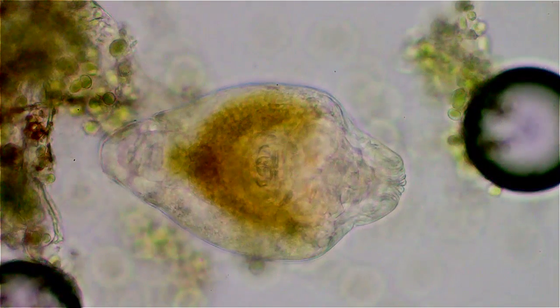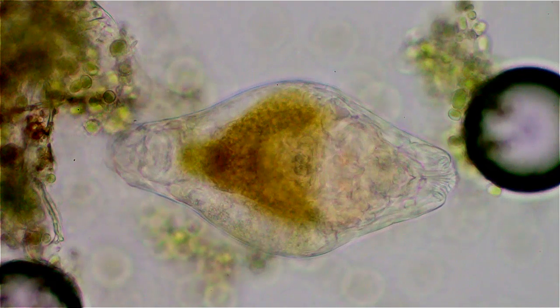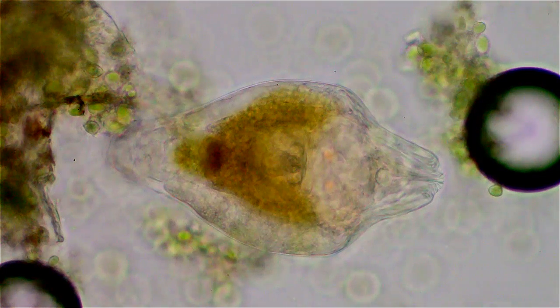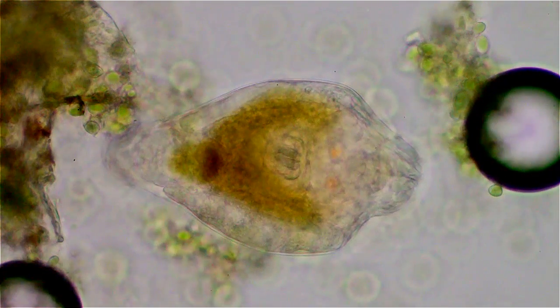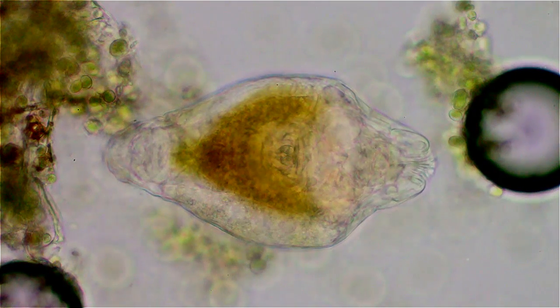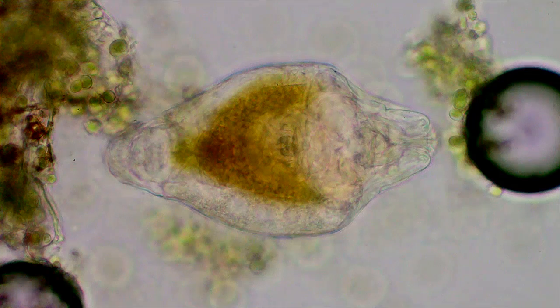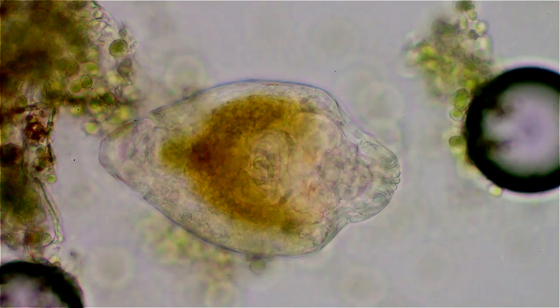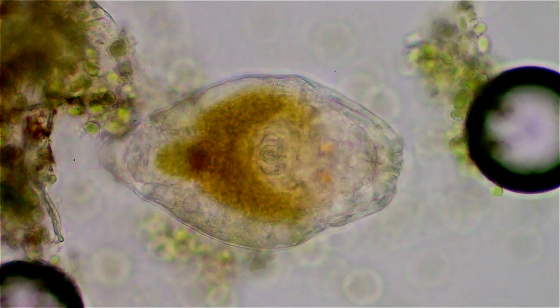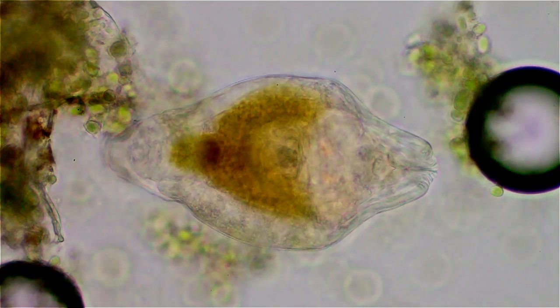This was taken from a sample off the inside surface of the glass lid of my large microbe aquarium, which is a three-gallon glass carboy. It looks just like one of those old candy jars in the old drugstore movies. The inside of that has got a lot of algae growing on it, and this morning I took a cotton swab of it and put it on a slide, and there's all kinds of rotifers in it.